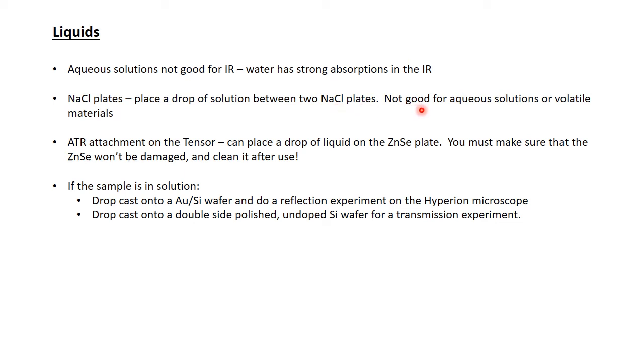Now, this is obviously not good for aqueous solutions or really volatile materials. Aqueous solutions are going to dissolve your sodium chloride, and volatile materials may evaporate before we get a chance to measure them. Another option for liquids is the ATR attachment on the Tensor.